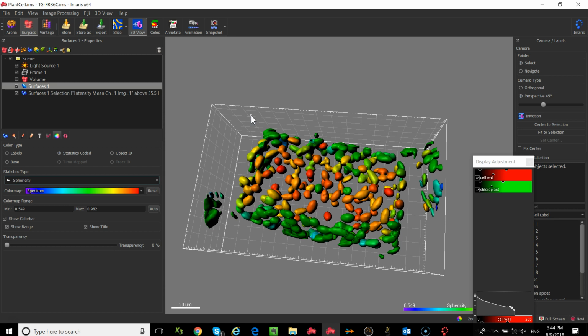Yes. Let's say you had a membrane marker of a cell, how could you fill that space? So we have another model called Cell. And Cell is specifically designed to work with membrane labeled structures. So whether it was a lamin for nuclei or an actual membrane marker for the cell, you would need to use that model in order to pick it up. We're going to cover that in the next session.